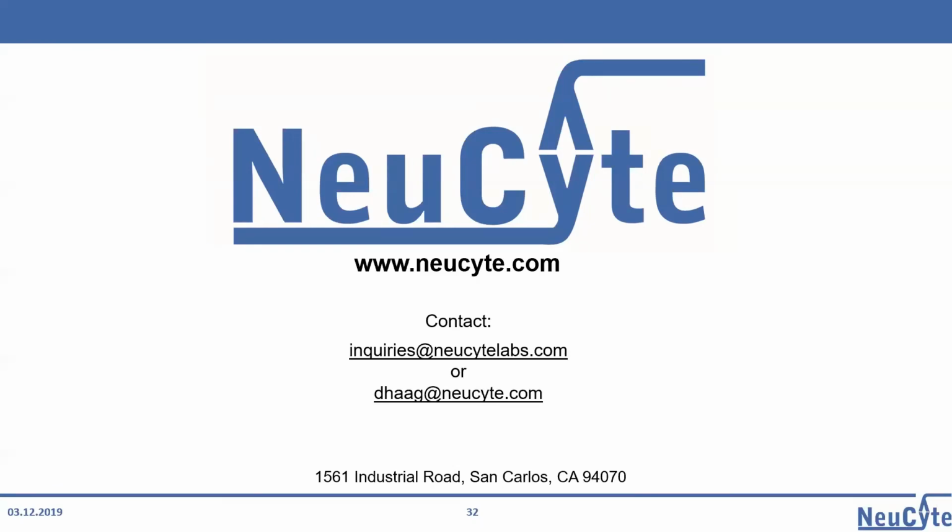Okay. But you don't want to do that, right? I mean, if you can measure synchronized and mature neural activity after 4 weeks, you want to do that. Right. So have you tried other medium to high throughput technologies such as calcium imaging with the Synfire neurons?